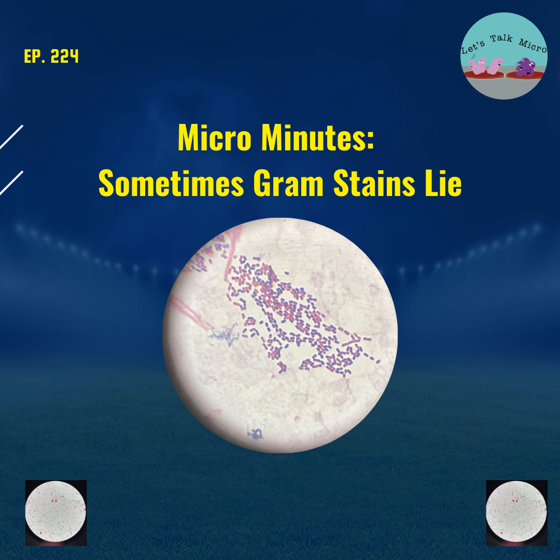But let's say that even if you over decolorize or under decolorize, right, from a place of practice and repetition, you have to be looking at some other things. You're looking at your morphology, your arrangement. So even if you see something that looks like gram negative cocci, but you're looking at the morphology and the arrangement, and you see that the arrangement is like clusters or chains, then you know something is off because that's not a normal arrangement for gram negative cocci.